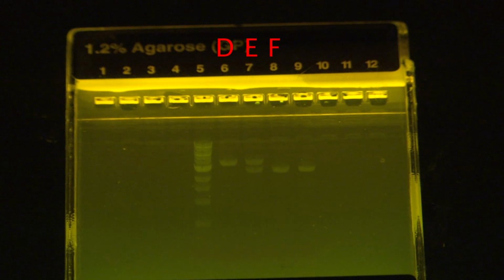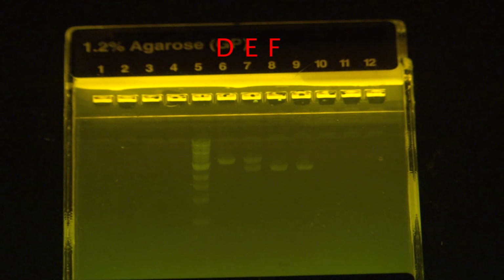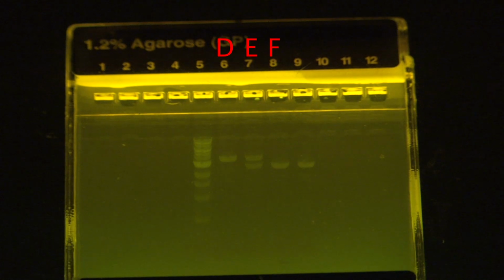Welcome back. So in the gel you just looked at, suspects D, E, and F had the following DNA patterns. Suspect D had one band that was higher up in the gel. E had 2 bands, one that was higher and one that was lower. And F had 1 band that was lower.